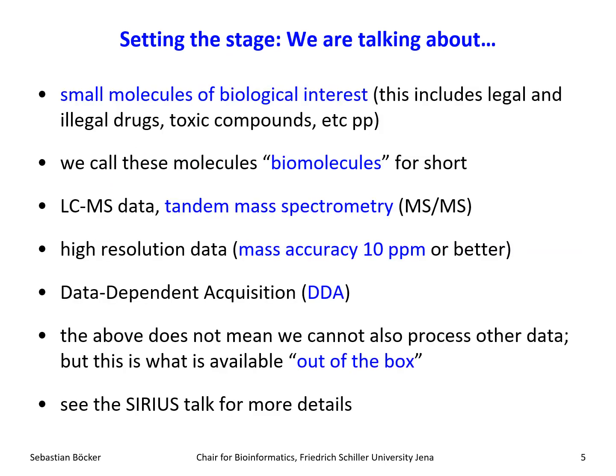Now, setting the stage, I showed this slide before. As I said, if you want to know more details, please see the Sirius talk. But to go over those things that we need very shortly, we are talking about small molecules of biological interest, which we will call biomolecules. We are analyzing them by liquid chromatography mass spectrometry. To find out about their structure, we are using tandem mass spectrometry.